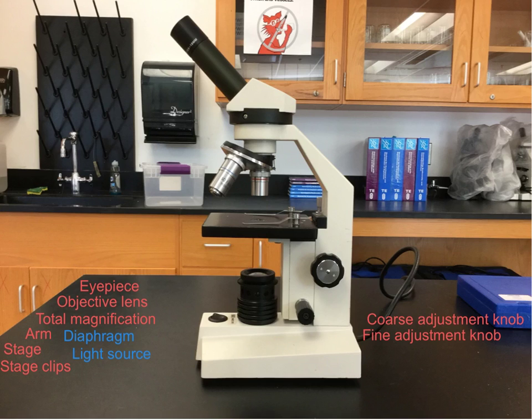pick up the microscope using the arm and support it with another hand on the base, and then finally bring it to the cabinet and return it safely in an organized manner.